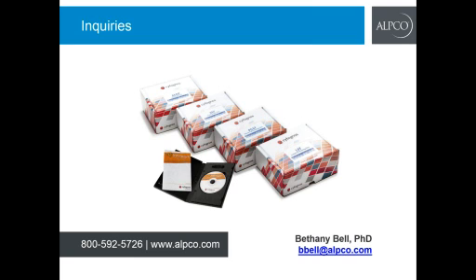Does the EuroFlow protocol require a specific instrument? Well, EuroFlow was designed at the beginning for, of course, an 8-color or plus instrument, first designed for the BD Canto 2. But now the EuroFlow consortium is also doing validation studies with other machines, and we know that in a few months all these studies will be released, and all protocols will also be adapted to the Navios machine.